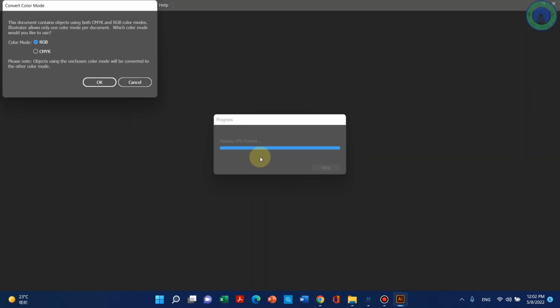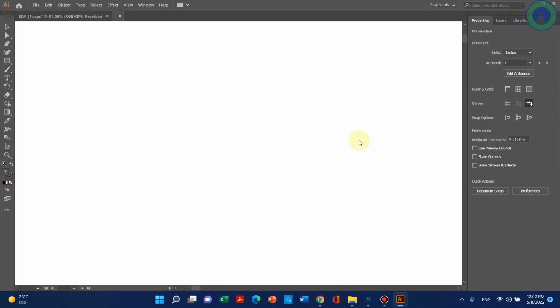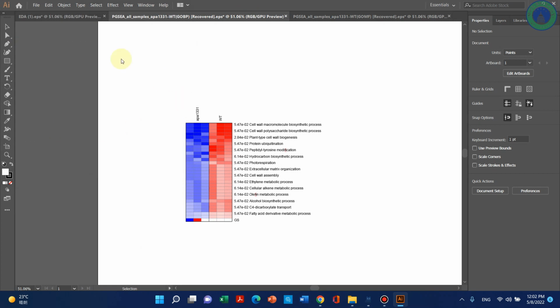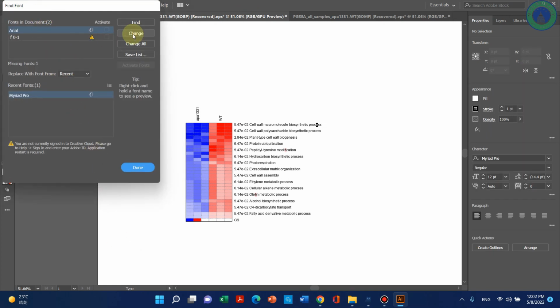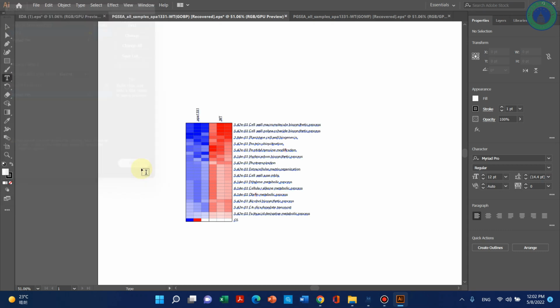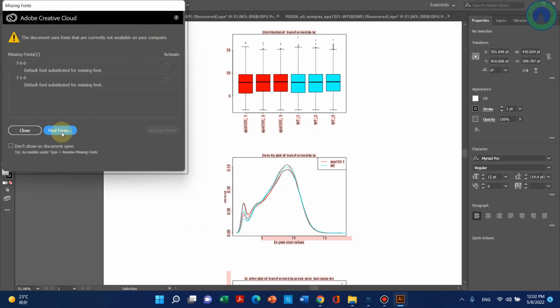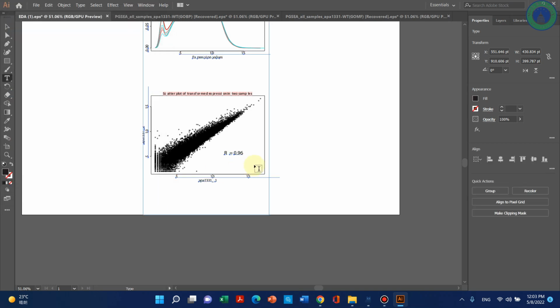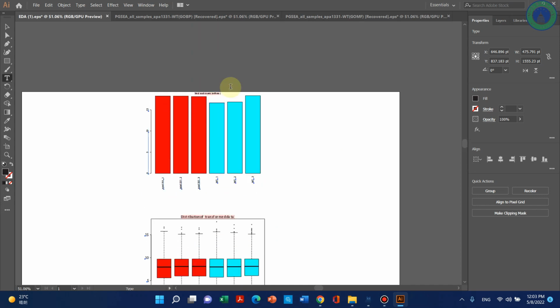So let's wait. Yeah, you can simply click 1. Yeah, from here you can see some of my previous files already opened. Actually they say the text is not found, but no problem, we can choose a new one. Yeah, here is that file which we have just imported. It is also saying that, oh okay, no problem, we can change the text. So this is the file which we imported from there.